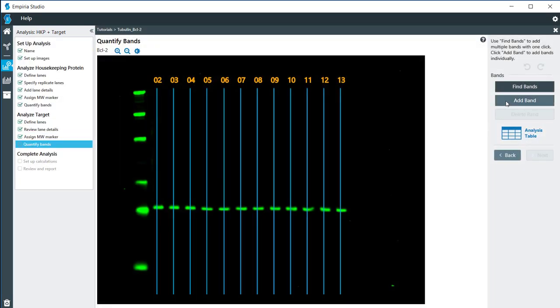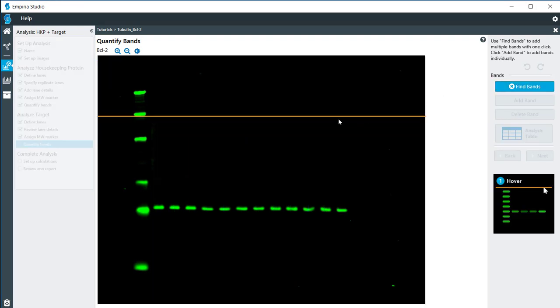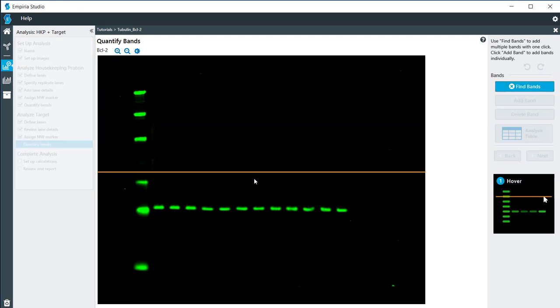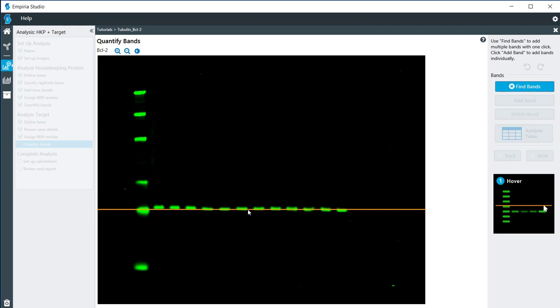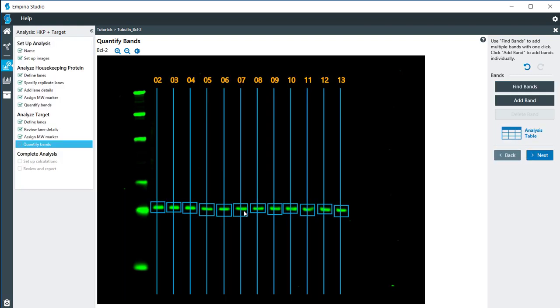Now again, I can either add the bands individually or I can let Empiria find the bands for me. So I move that to the proper location, do a single click, and then again. If you need to, you can adjust the size and location, but everything looks okay with that. So I will click on next at this point.